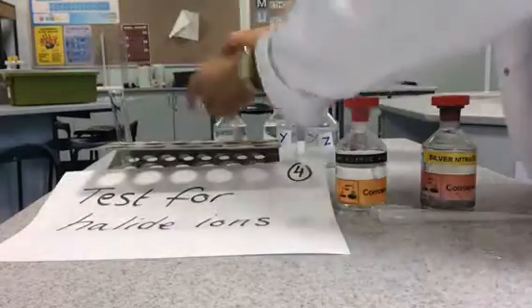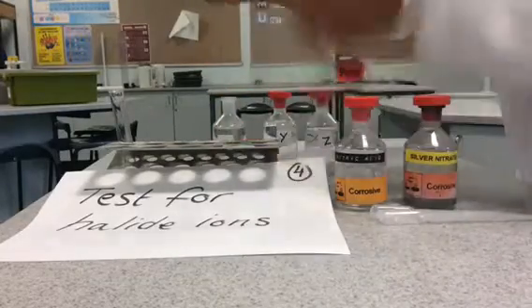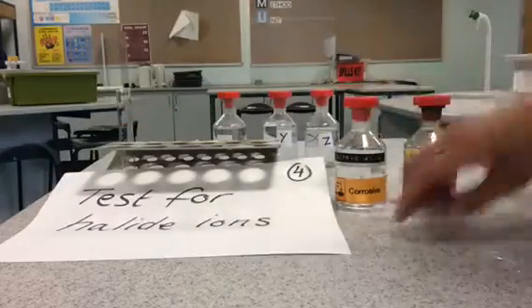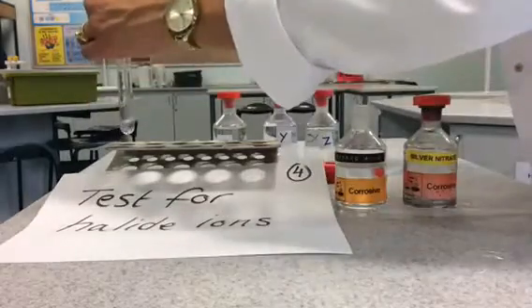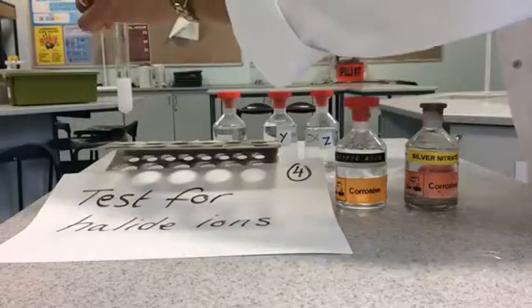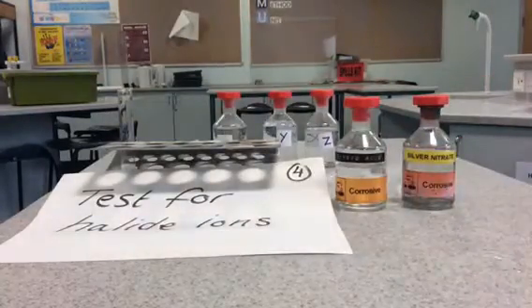Test for halide ions using nitric acid and silver nitrate. Take one centimeter cubed of your unknown ionic compound and place that into a clean test tube. Use another pipette to add one centimeter cubed of nitric acid, then use another clean pipette to add one centimeter cubed of silver nitrate. If there are halide ions present, you should observe a colored precipitate. Record your observations and identify the negative ion.